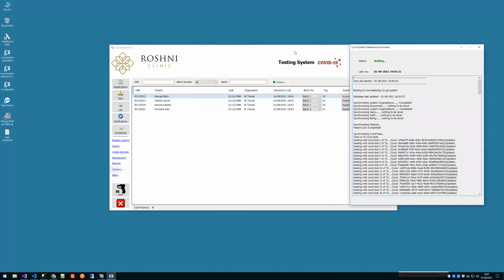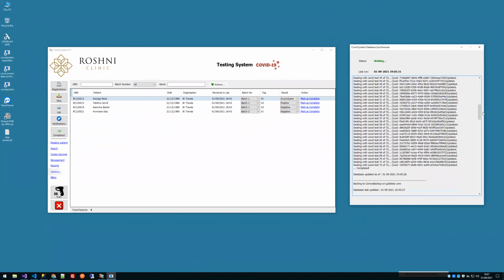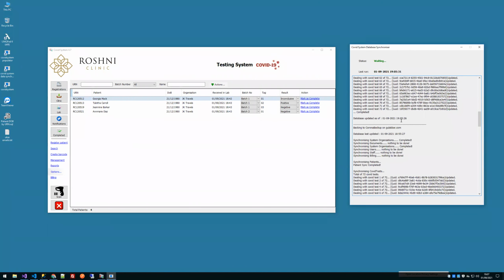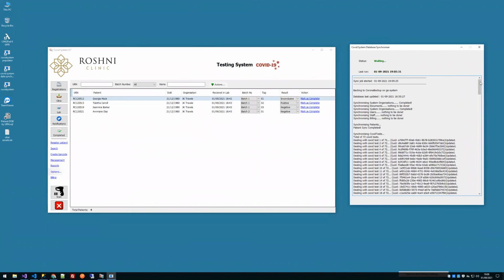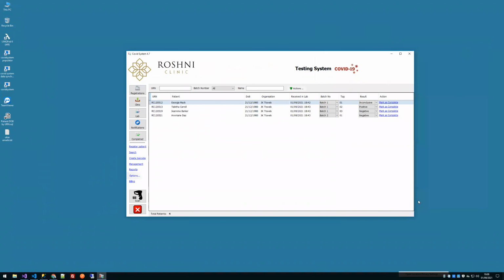Just some other stuff. There's backups going on, so the database that you're punching all your patients into is being backed up on a regular basis. Every few minutes it's backed up, and it tells you when it last ran, and what COVID tests were backed up. It's backed up onto 3 different machines: GA systems, gulakbar.com, which are all my servers, and my local machine. So you're not losing any data, which is key for me. It runs every 5 minutes and slows down at night time because there's little activity.